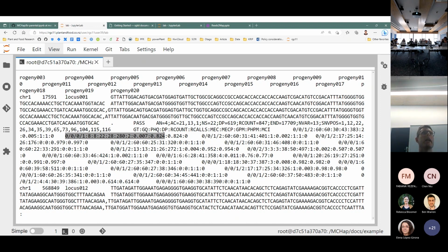It seems kind of ridiculous that we'll just run it through again and now we get better probabilities out. It seems like nonsense. But the reason is that this is a Bayesian approach, and so changing the prior distribution changes the posterior distribution. By restricting the analysis to only look at a subset of the possible haplotypes, the posterior probabilities for the genotype calls will be higher.